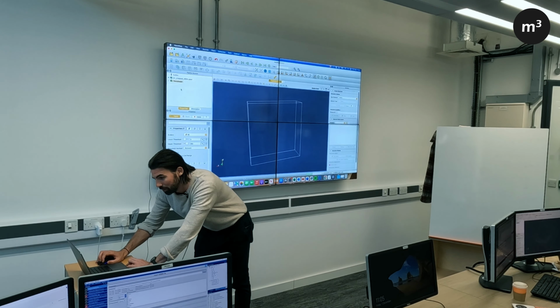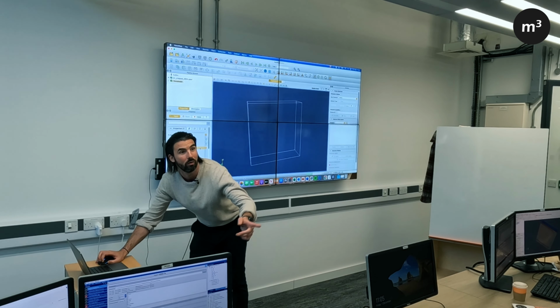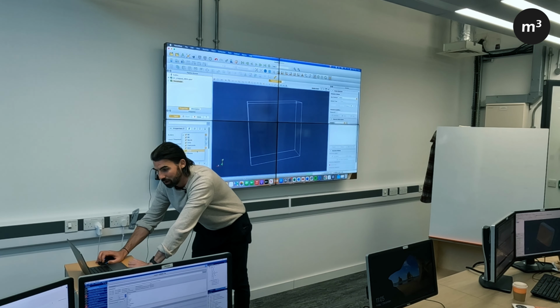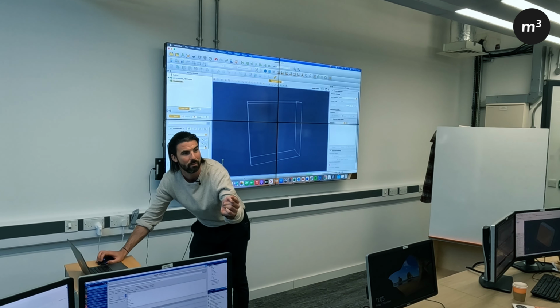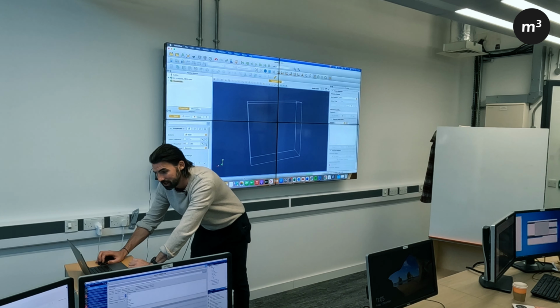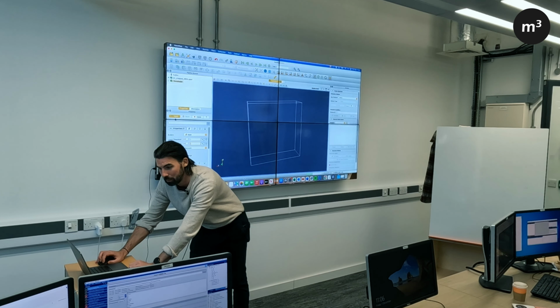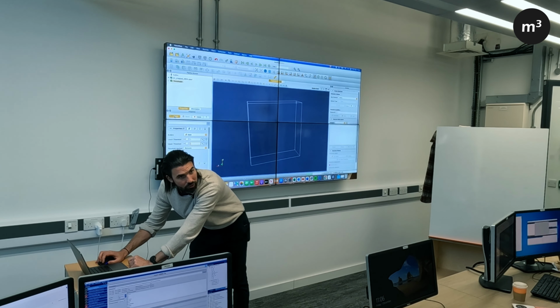Good, right, and then we will go threshold, and we can threshold the data in this drop-down list. We can threshold the data using whatever scalar quantity from our cell data we want. So I'm going to use mask. If we click mask, remember we've run our threshold objects filter, which means that each voxel has either a 1 or a 0 for if it's in or out of the mask. So if we threshold our data, click the refresh here, to 1 and 1, and then click apply, that will visualize every voxel in the data set which has a mask value equal to 1, which should be all of our actual data.